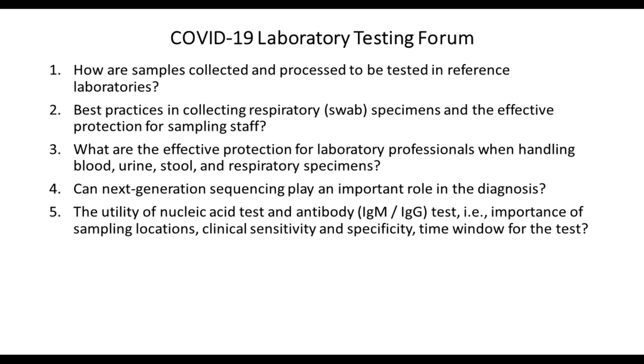Now let's move to question number 3. What are the effective protections for laboratory professionals when handling blood, urine, stool, and respiratory specimens? This is actually a key question for the U.S. colleagues who are just beginning to do the testing of all types of specimens. I think Dr. Frank Yang from Adicon also has a lot of experience, and let's get his input on this question. Dr. Yang, please.